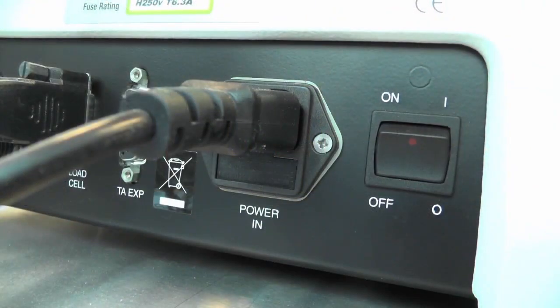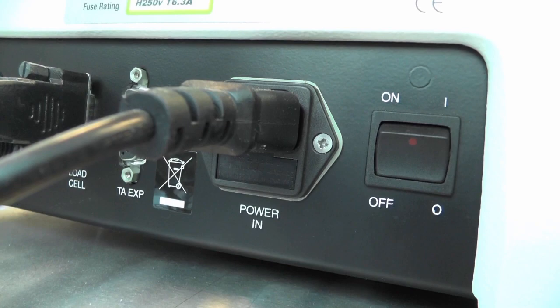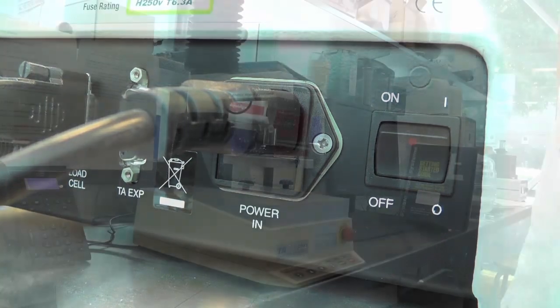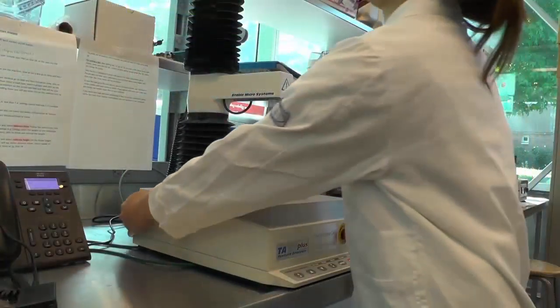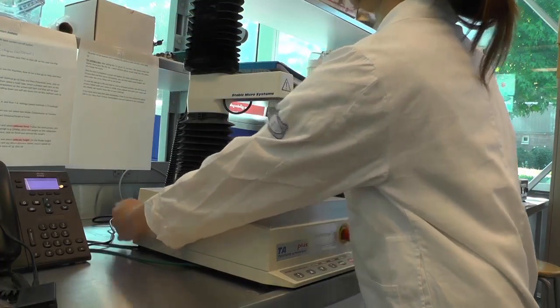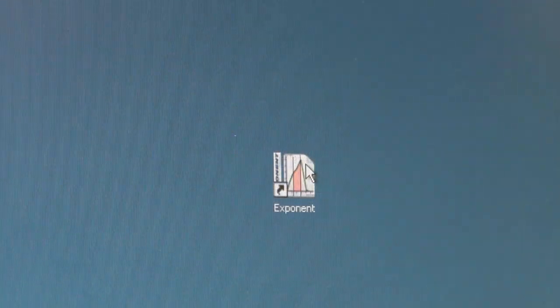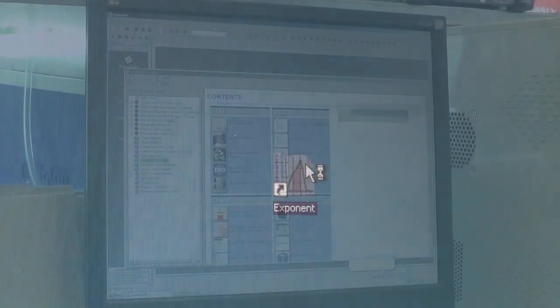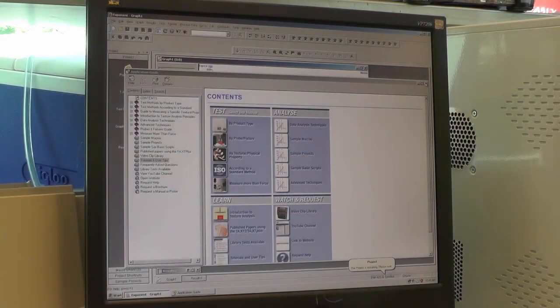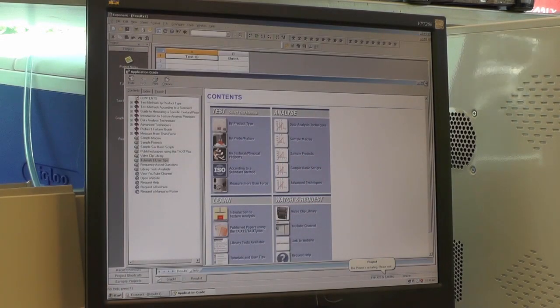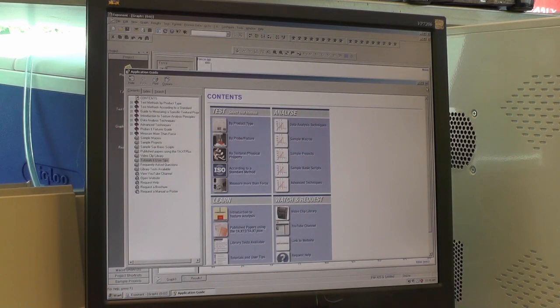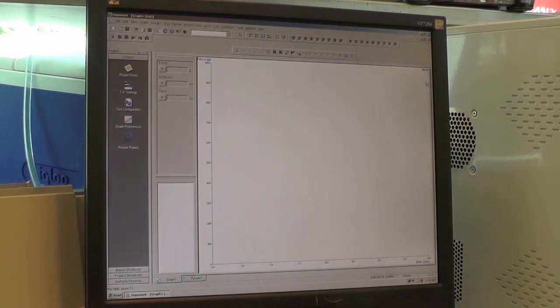To turn on the instrument, flip the switch located in the left back corner to the on position. Next, turn on the computer and open the exponent software. Close the help screen.